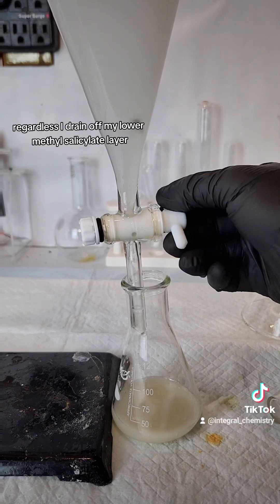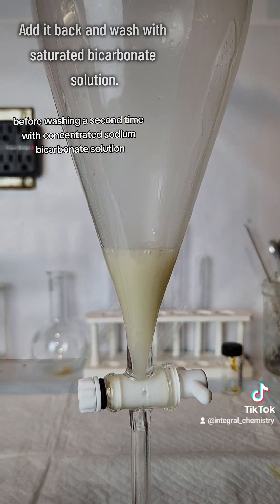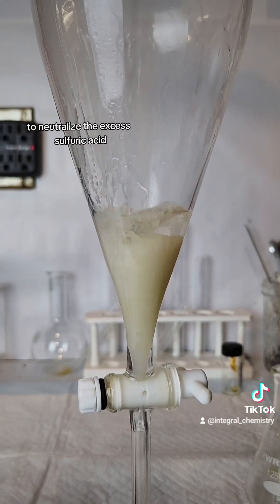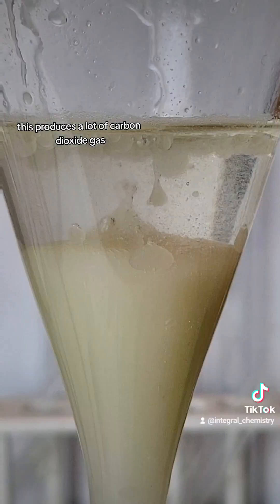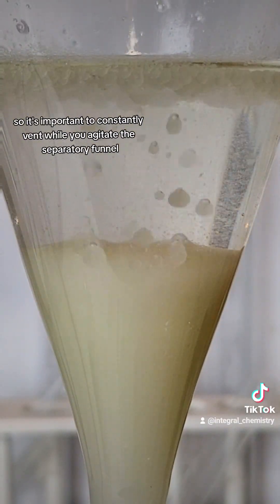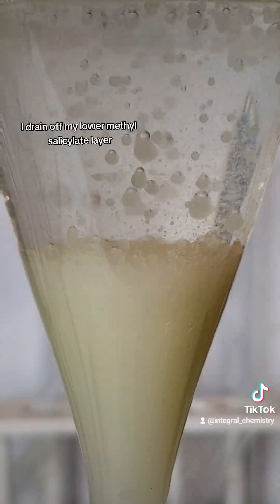I drain off my lower methyl salicylate layer and then add it back to the separatory funnel before washing a second time with concentrated sodium bicarbonate solution to neutralize the excess sulfuric acid. This produces a lot of carbon dioxide gas, so it's important to constantly vent while you agitate the separatory funnel. After no more bubbling can be observed, I drain off my lower methyl salicylate layer.